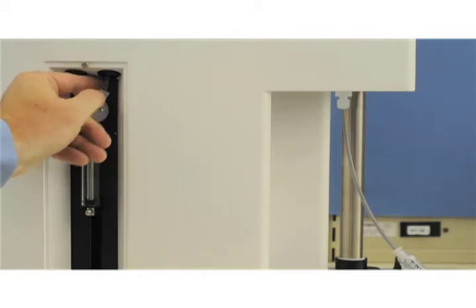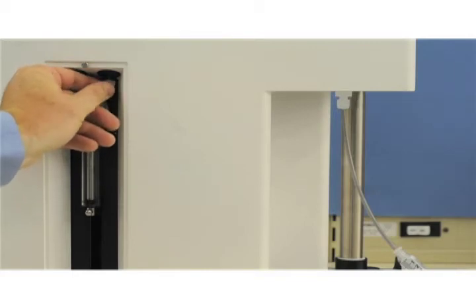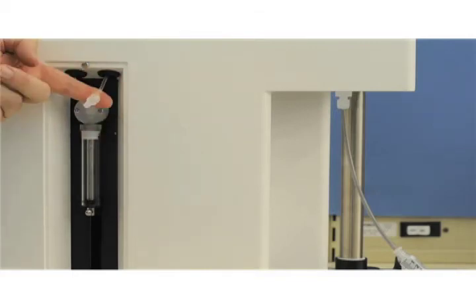Disconnect the tube fitting connected to the 2 o'clock position of the syringe valve. Be careful when removing the fitting from the valve so as not to damage the flange at the end of the tube.